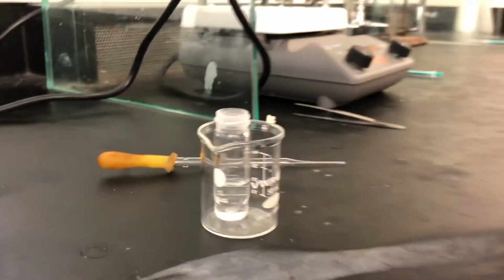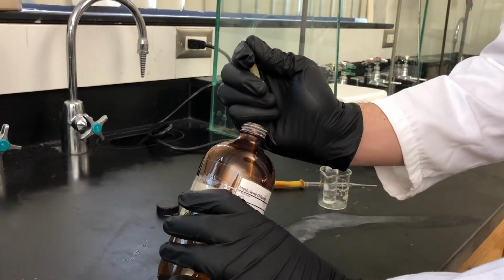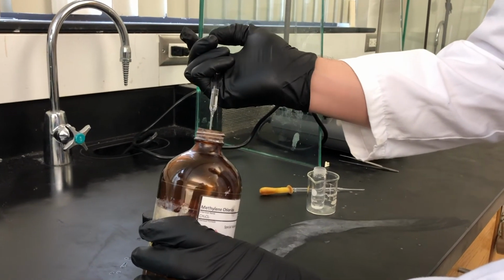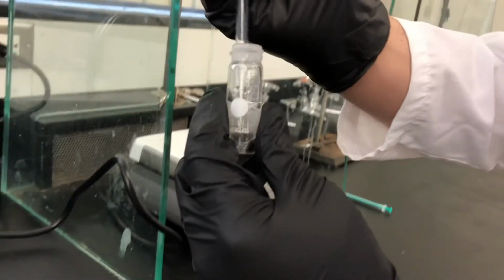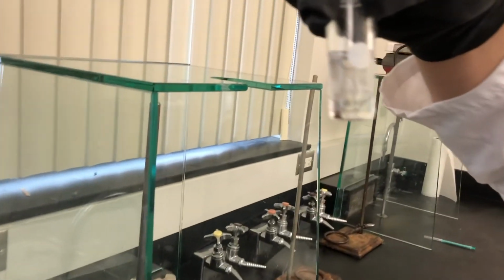Okay, so we're going to add another little bit of methylene chloride. We're going to do this 3 times to extract as much of the cyclohexanol as we can from the aqueous layer. Then mix this around. Notice the 2 layers are trying to separate.